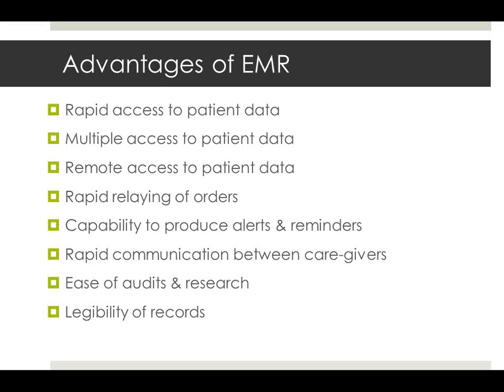What are the advantages? Well, rapid access to patient data. You no longer have to hunt down the patient's chart on the ward. Anyone can access the data from anywhere. So multiple people can access at the same time. It's not one chart. Now anyone can have access to it. You can have remote access, rapid relaying of orders. So now we're getting orders coming across instead of by paper. Now we're getting them electronically into SunQuest. It has its own problems, but eventually that will be a much better system.